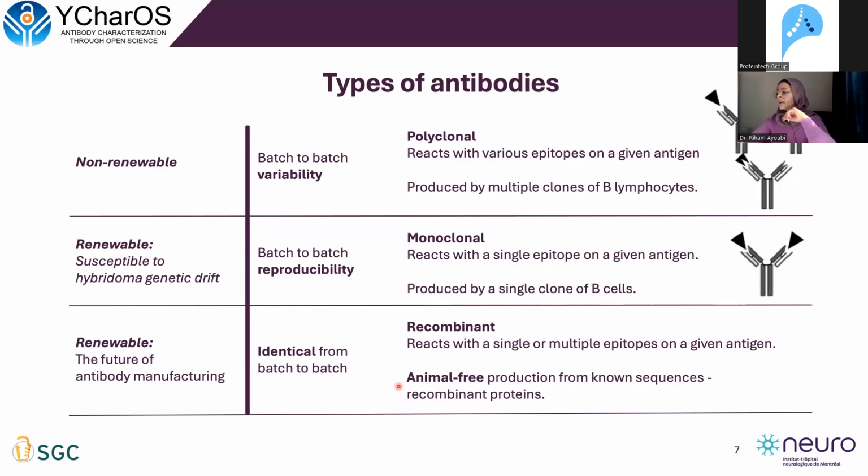While recombinants are typically a version of monoclonals, manufacturers are now investigating combining multiple monoclonals that can target different epitopes of the protein while maintaining that sensitivity of detection, but replacing the inconsistent traditional animal-derived polyclonals.